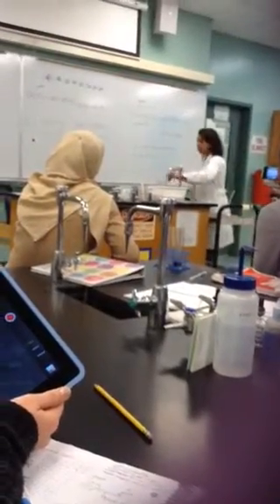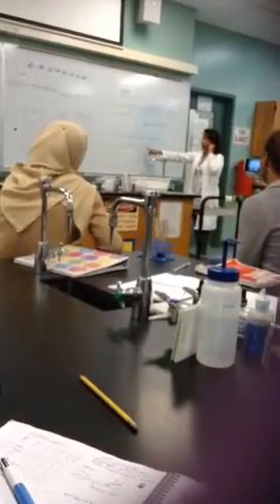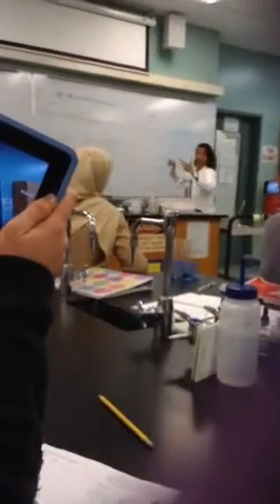Now, test tubes 5 and 6, we test for starch. There was only starch present there. So you see, starch was definitely present, and it's nice and thick, so it was more in this form, because it didn't have any amylase.